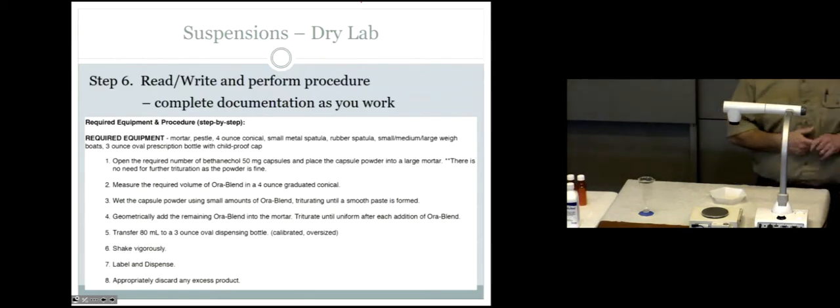And for the excess method, it's what Judy said at the end, it's pouring out and dispensing all of it. You're so proud of what you made. Don't give me all of it in the excess method, right? Just give me the amount prescribed. Make sure you're careful with that.